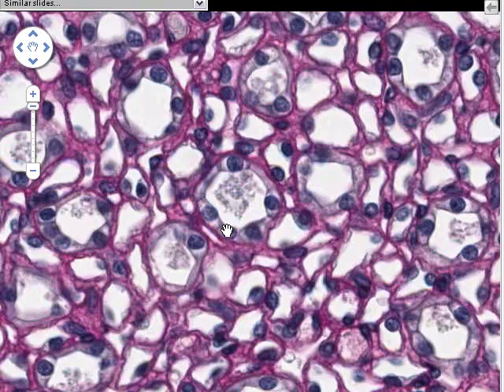And in the cells which I see here, where I can see cell borders and where I can compare the size of the cell to the size of its nucleus, we find that the height of the cell is very closely equal to what the width of the cell is. It's maybe a little bit wider. So I would call this a low cuboidal epithelium tending toward squamous. As we look here, here's an even lower epithelium.